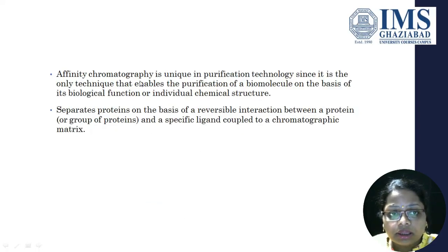Now, affinity chromatography is a unique purification technology, and it is the only technique that enables the purification of a biomolecule on the basis of its biological function, that is, its biological properties or individual chemical structure. So it separates proteins on the basis of reversible interaction. That is what I was talking about before, that the interaction between the ligand and the analyte has to be reversible.